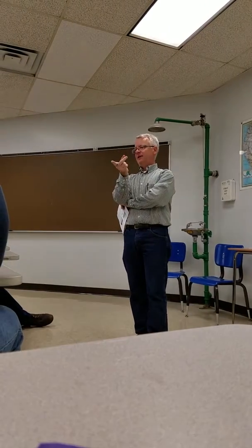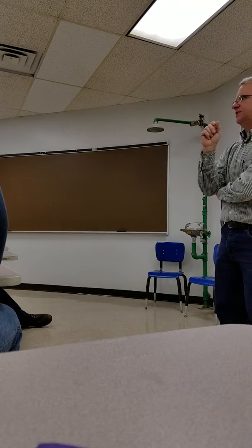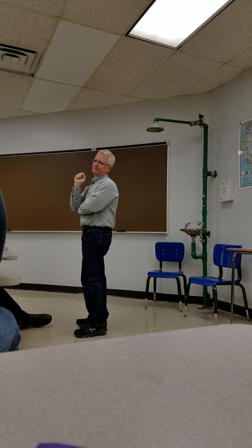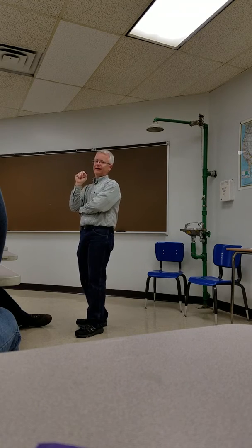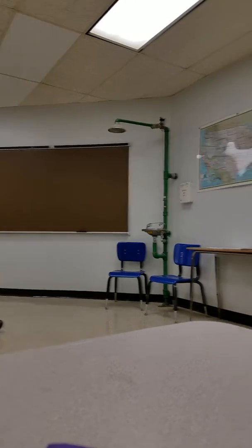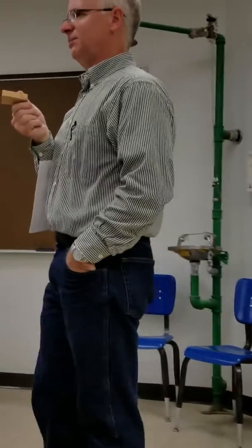And basically what I want you to do is look at it and maybe look at them some under the dissecting scope and just take a couple of images of each piece of wood and label that figure. Okay? So this is less magnified, but for instance in the oak, I want you to look at the cross section and look at what the early wood and late wood looks like and what's making it look like that. The early wood looks dark in this oak cross-section because the early wood vessels are large, like I pointed out.